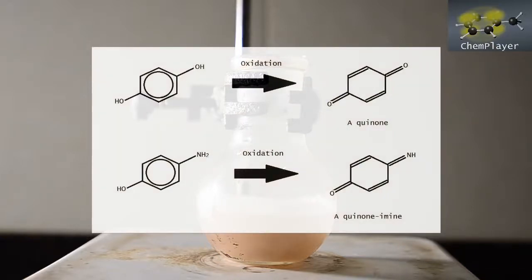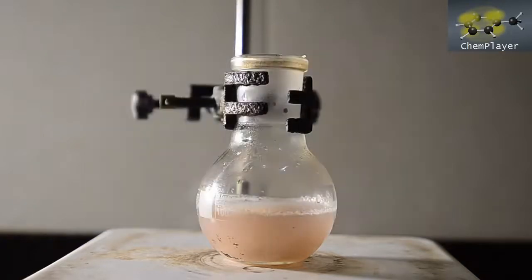When paracetamol and related phenols oxidize they can form compounds known as quinones. These quinones are highly reactive and ultimately end up forming complex dye-like compounds with very strong colors. The slightly pink color in the paracetamol we use is due to the tiny presence of these compounds formed by atmospheric oxidation. In fact, phenols tend to oxidize quite readily in alkaline solution and with heat, so we're running a bit of a risk with this reaction. But let's see how it goes.